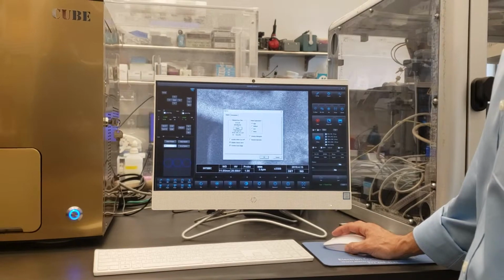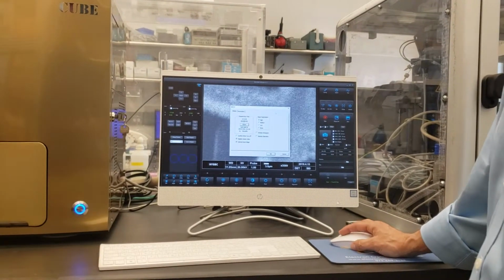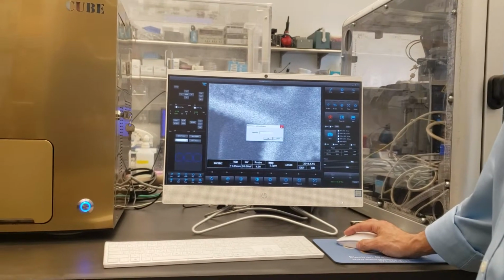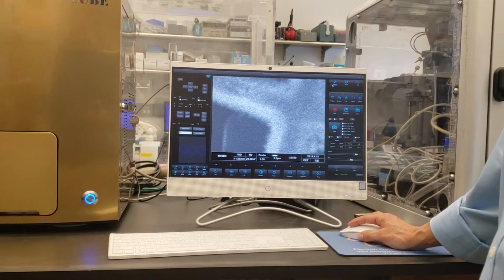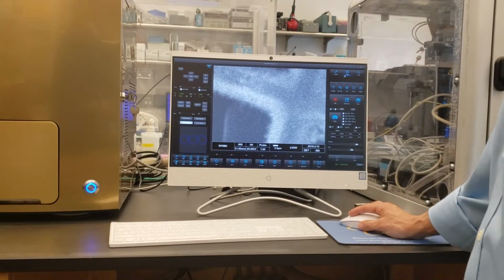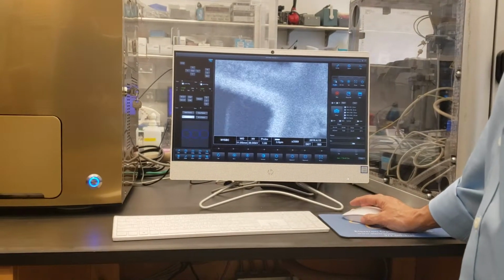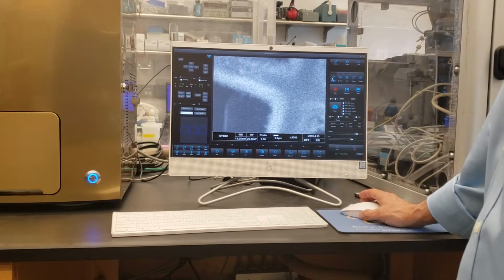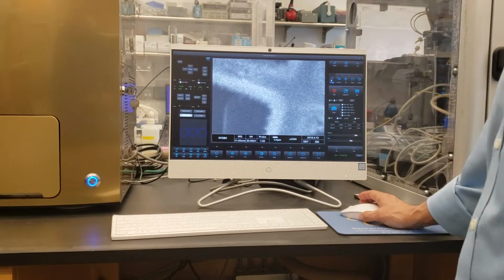It also tells me how long the filament's been on for, 31 minutes. So it gives me some filament life, great. And this right here is just some testing for us, and it requires our password. So realistically, the only thing you can hit here is the option tab. So nothing to worry about there. When you install a new filament, we use this automatic filament saturation button. We click on that, and it saturates the filament for us. We don't have to worry about that.